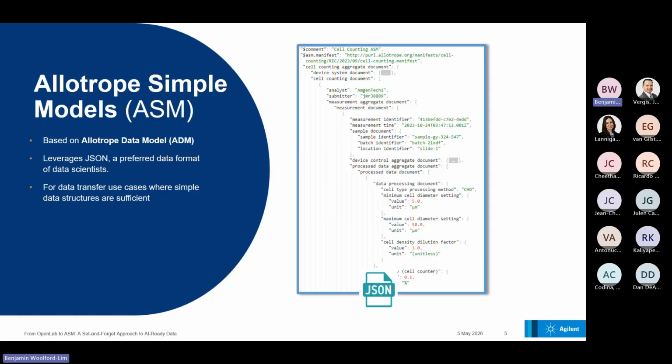Just to give you an example of what the JSON file looks like, Heiko has more details at the end of the presentation, but as you can see, it's a very structured JSON format. It contains the analyst, the submitter, timestamps, volumes, and it's all in standardized units. It seems trivial, but different techniques or different vendors use different units: one uses millimeters, the other centimeters, one uses minutes, the other seconds. In this ASM file, it's all standardized. All these units are predefined. So once you have your JSON file, you don't need to worry anymore about units and conversions.